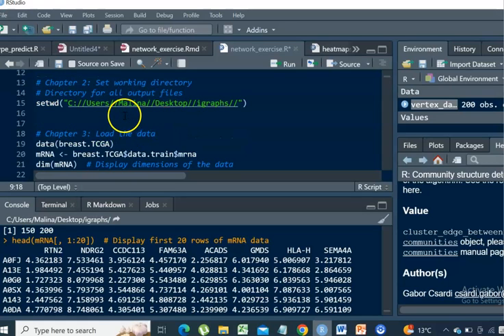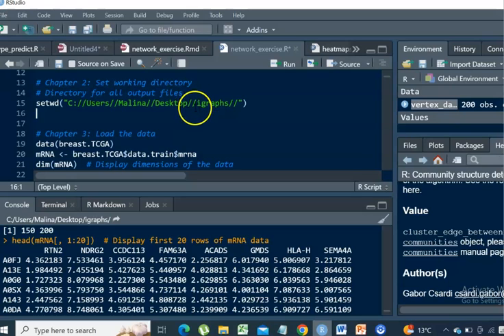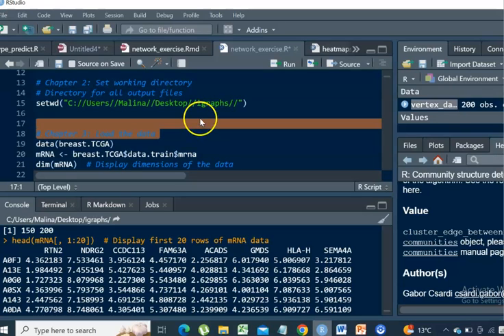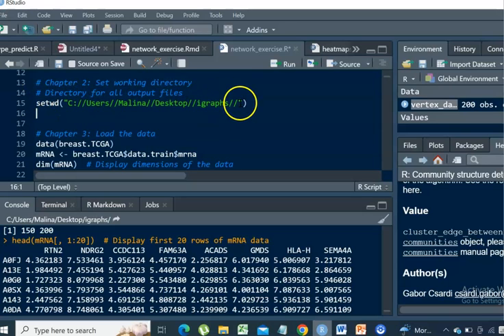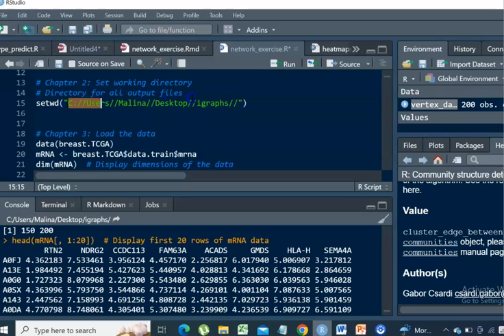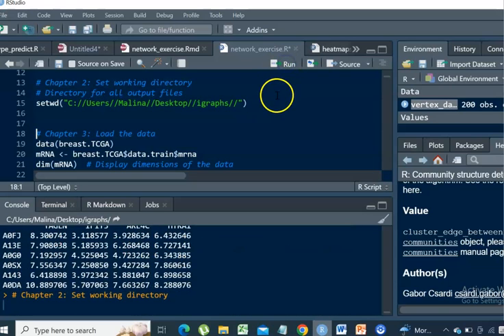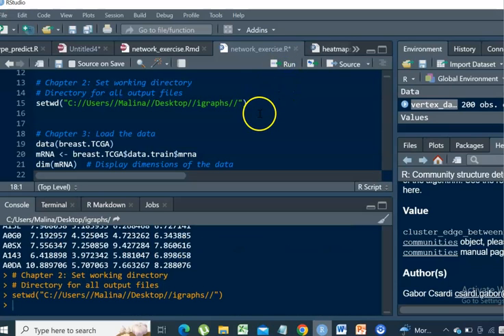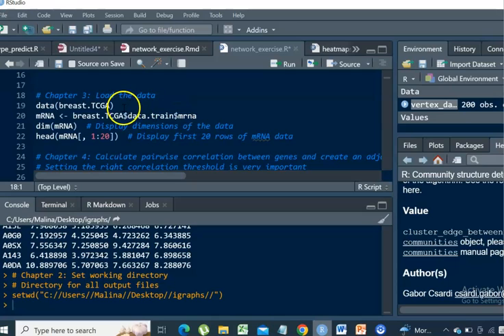Another good practice is to create a directory where you're going to place all the output files from our analysis. A suggestion is that you create a directory on your desktop and call it iGraphs. You will need to obtain the full path to this directory and replace it here between the double brackets. Then you will need to run this command to set your working directory where all output files from this tutorial are going to be stored.